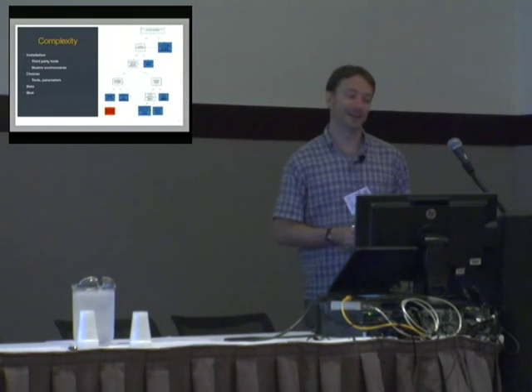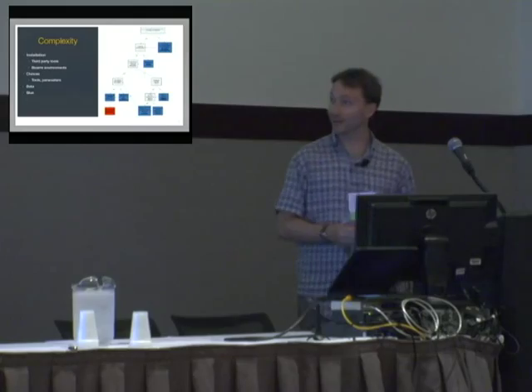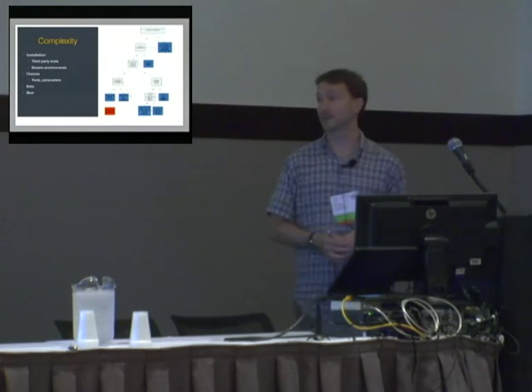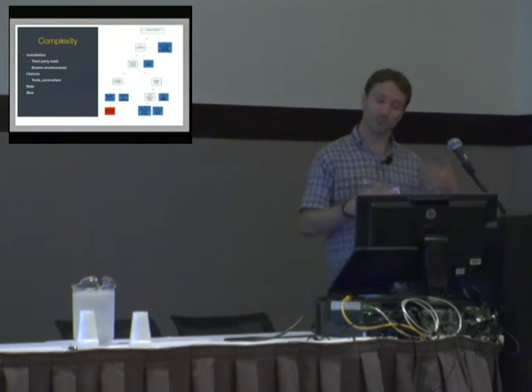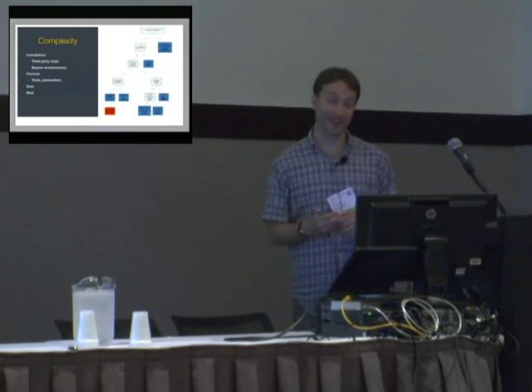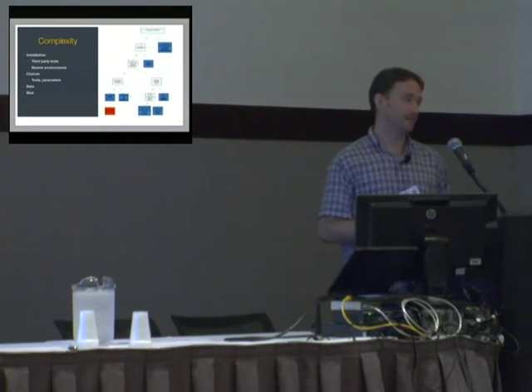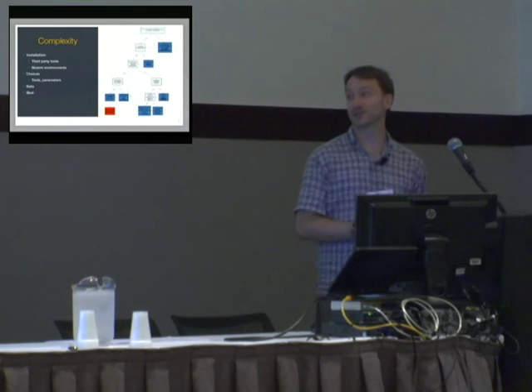So for example, there's maybe 30 different splice read aligners, and all of them, if you read the papers, all claim that they do the best. And so you have to choose what tools you want to use and then learn how to use each tool. Handling the data itself is complex. So if you look on SEQanswers or Biostars, a really common question is, why don't my annotations match?